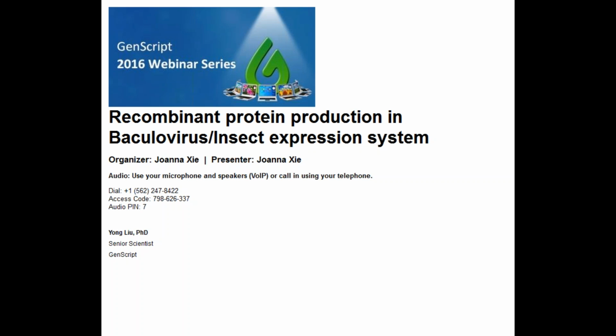Plus, fresh virus should be key for protein production. Generally, we recommend using virus within 3 weeks. Beyond that, you could see a depletion in expression. A tip for this is you can passage the virus once for a fresh application, from P3 or even from P1, with more virus seed and more generations.